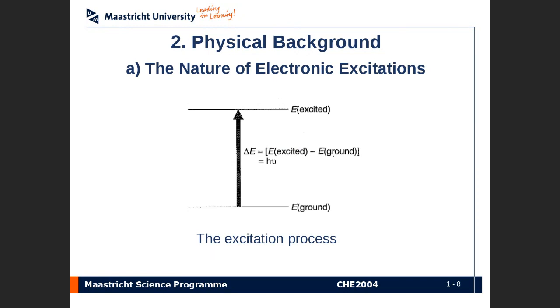And this is typically the case with many spectroscopies, but also with UV-Vis. In UV-Vis, we're essentially exciting electrons from a ground state into an excited state, okay? And this energy gap here, right, is going to be dependent on the chemical structure. And the chemical structure and the way the atoms are bonded together is going to affect this energy gap.